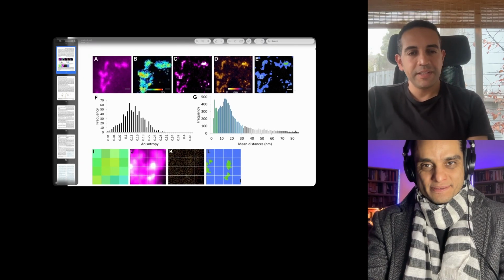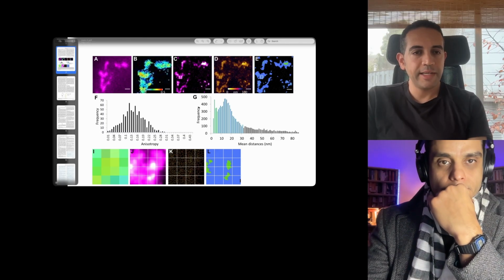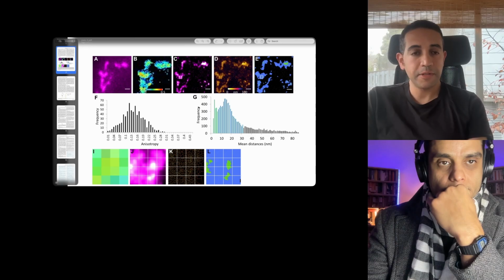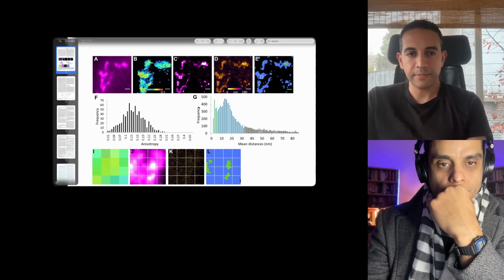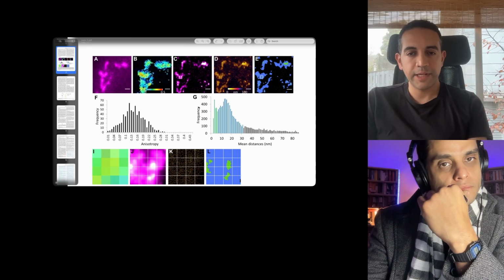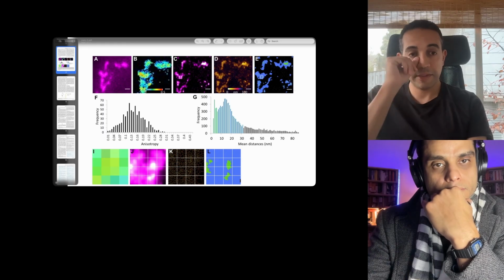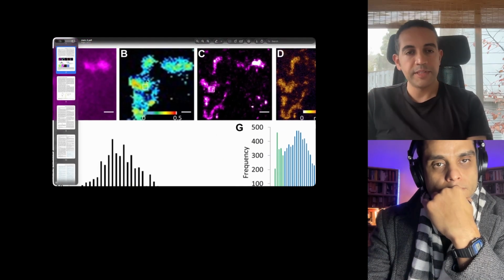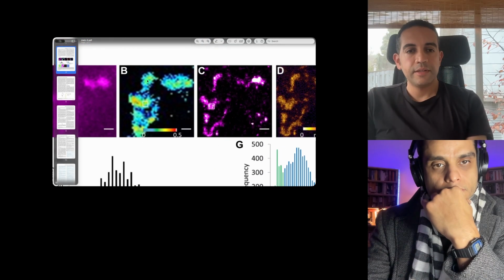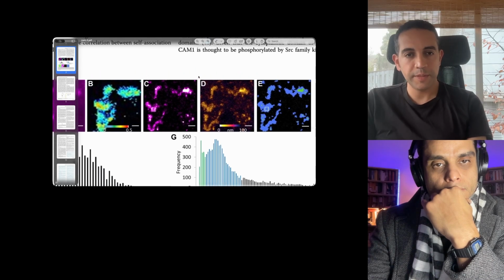So this figure, I think, summarizes the whole point of this exercise. So panel A, you have a cluster of CEACAM proteins. We knew that. B, you now have a pixel-wise anisotropy map, this concept, this enrichment in monomers and dimers. And so it shows you in red the regions that are more monomeric, in blue, green, the ones that are more oligomeric. And then in C, you have the super resolved image, the STORM image.